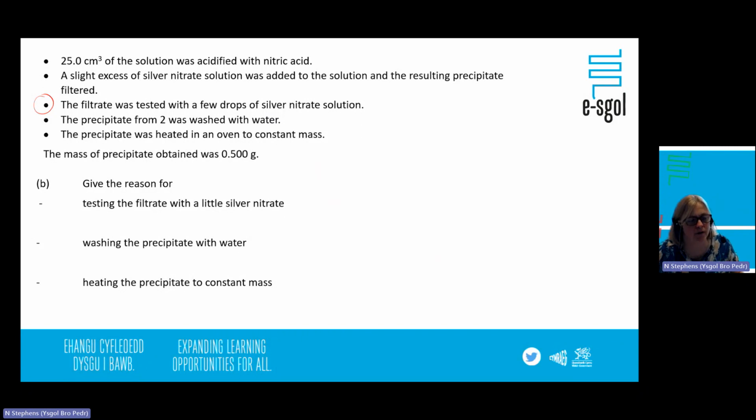Well, the purpose, if you remember correctly, was to identify the concentration of halide ions, and therefore it is very important that you have just the silver chloride present. And for that reason, you need to make sure all the water is removed. So you heat it to constant mass, because you are then confident at that point that there is no further water.